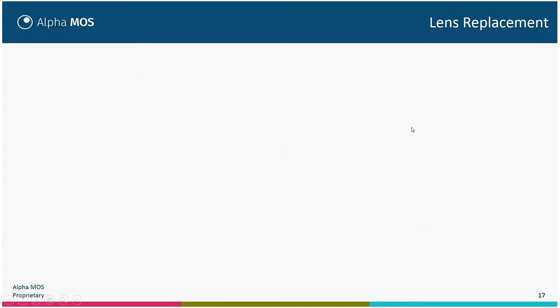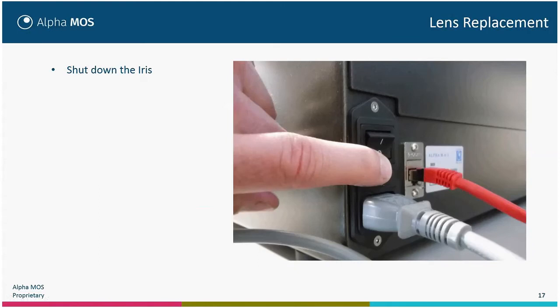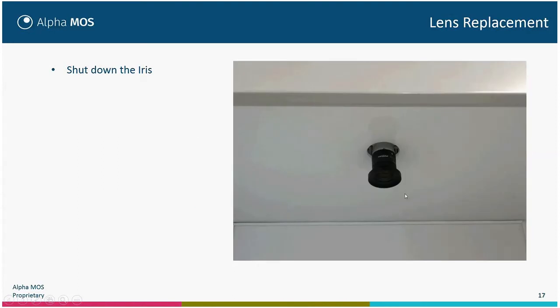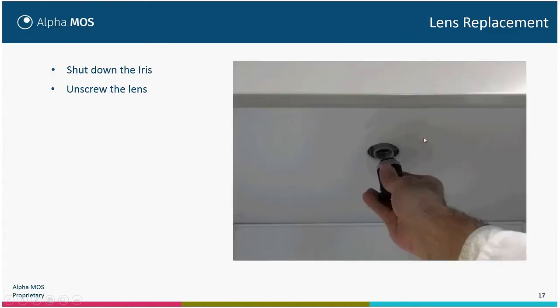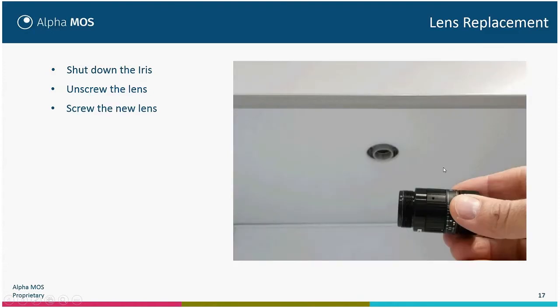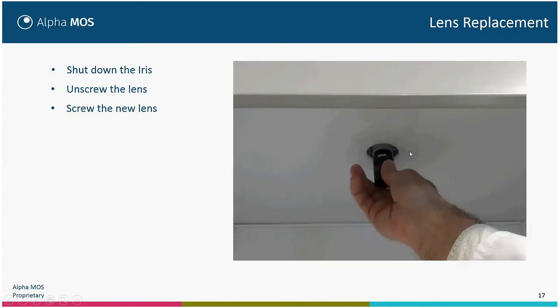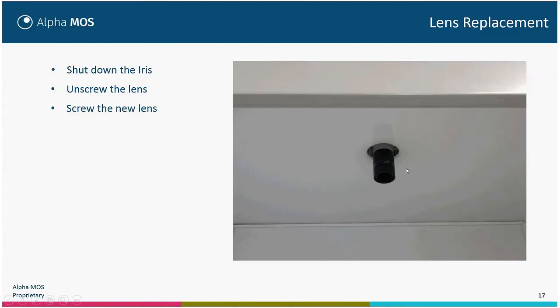Lens replacement is very easy. First, shut down the iris by clicking on zero. Then open the cabin and you will see the lens. Unscrew it delicately — be careful not to let it fall. Remove it delicately and put it in its protective box. Take the new lens. Never touch the glass optics with your bare hands — only touch the plastic parts. Screw the new lens in place with about five to ten turns. When finished, you will feel it seat properly — it takes only a few seconds.